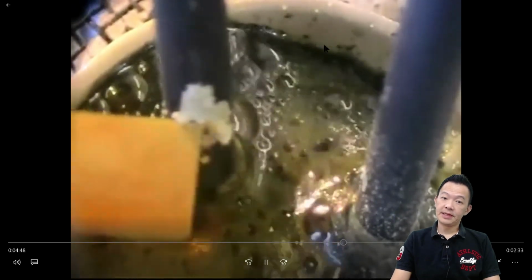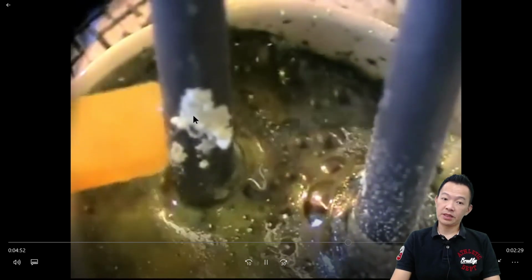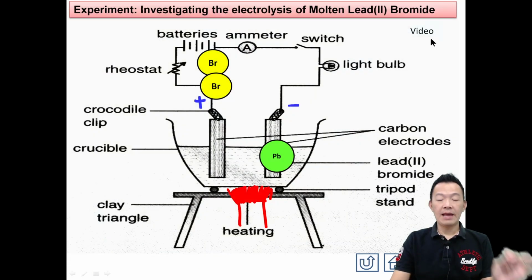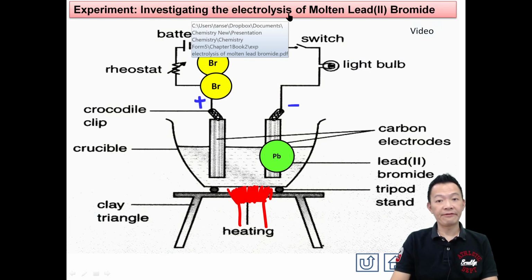叫 bromine， 这个就是我们的 lead。And bromine gas is acidic， 它酸性的 ，so that's why litmus paper turns red 啦，变成红色。 Electrodes here, hoping to see some shine, some sign. So lead bromide becomes lead and bromine. This is our experiment. So now fill in the blank a bit.